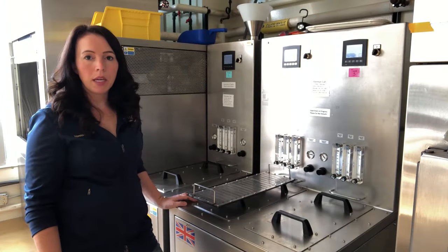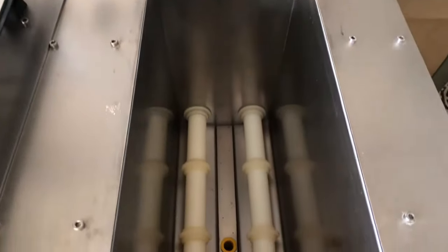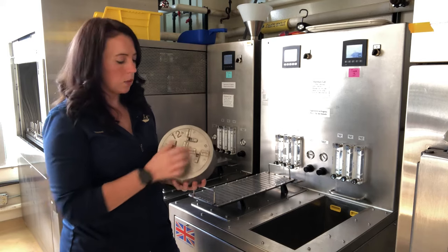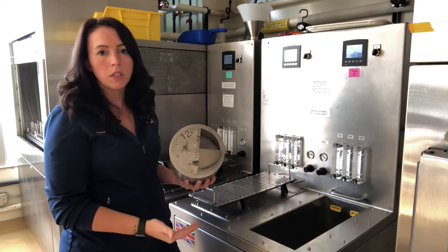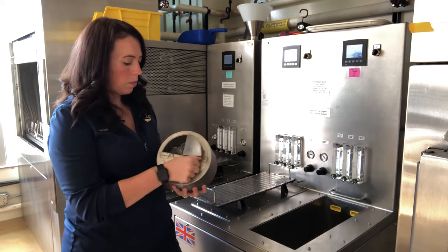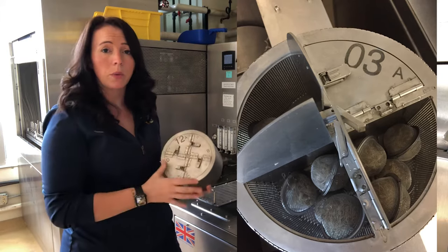Here we are at our malters. We have CLP malters out of the UK. Incorporated in this, we've got three separate steep-germ tanks — all identical. In these tanks we load individual cages, which are able to hold four samples each, and then four cages go per steep tank. Typically our malting scale is about 120 grams of barley loaded into each quadrant, so we're able to malt 16 samples a batch — close to 50 samples a week at that scale. We also have a Pico scale method where we load about six grams of barley into loose-leaf tea balls. We can fit six of those per quadrant, which gets us up to close to 300 samples a week that we're able to malt at that scale.